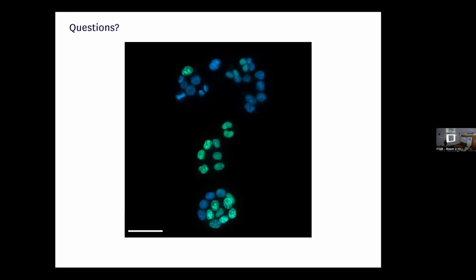Yes, and it could also happen in other scenarios like single molecule imaging. If you're imaging single fluorophores in single molecule microscopy, and they are very, very close together, you could actually be losing some photons because of energy transfer to nearby fluorophores. But for the question that you are asking, that would really be an extreme scenario where everything would be transferred to a nearby fluorophore to the point that you would not be able to image the donor. So we're talking about FRET efficiency close to 90-100%. That's not likely.